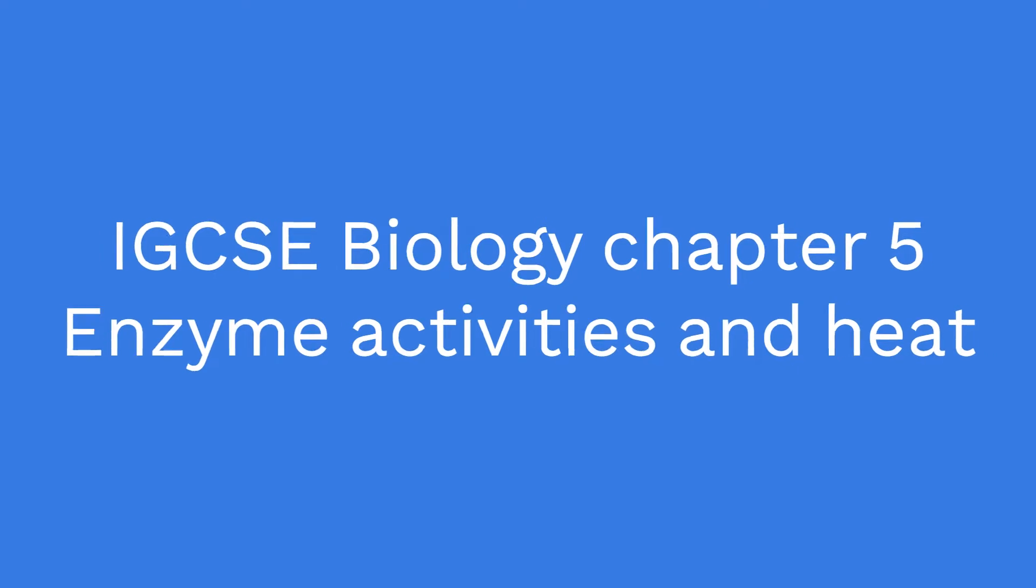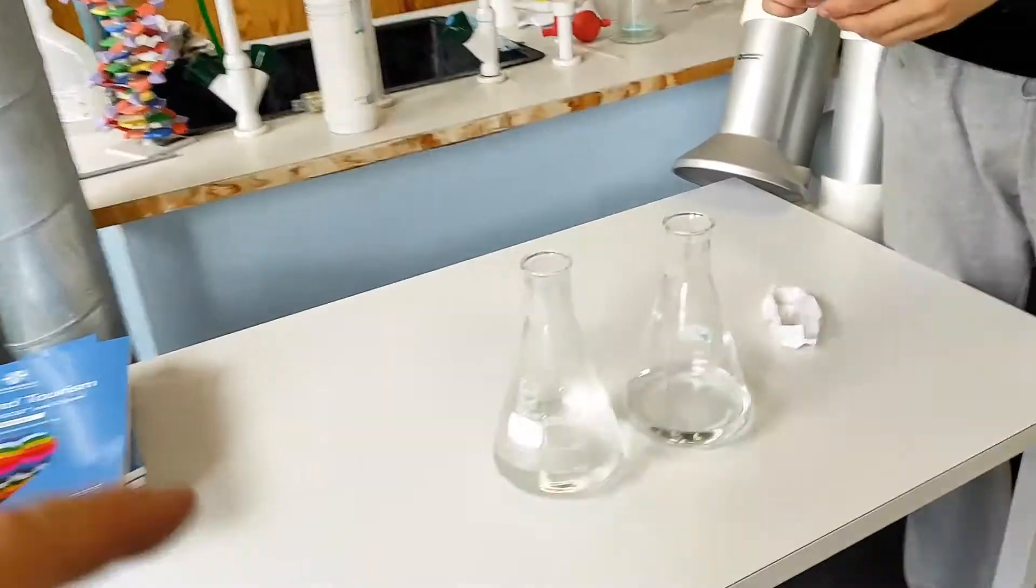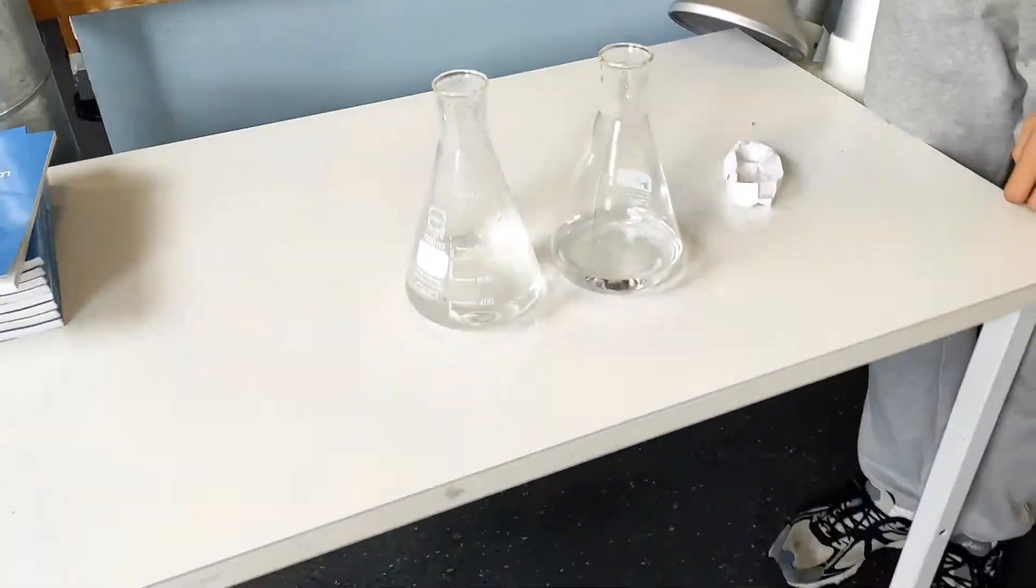Hi, happy assistant. Hello. Please put half a pack of yeast in the hot water and another one in the cold water.